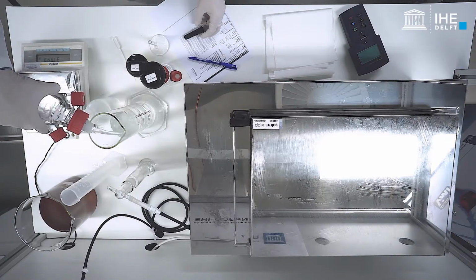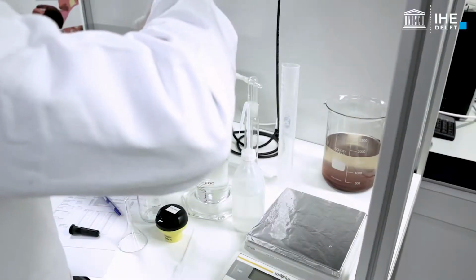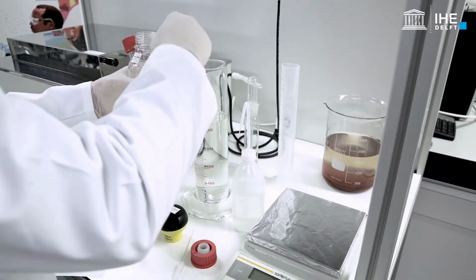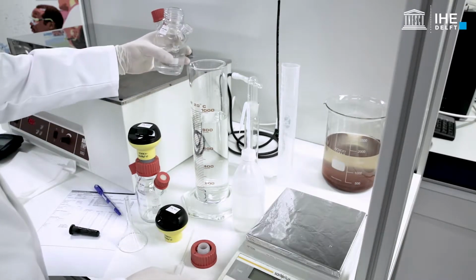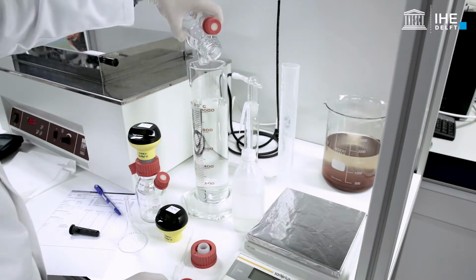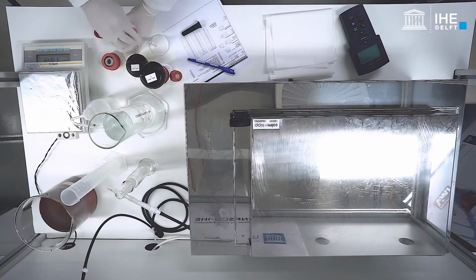Empty the reactor. Thereafter, continue with the preparation of the test.